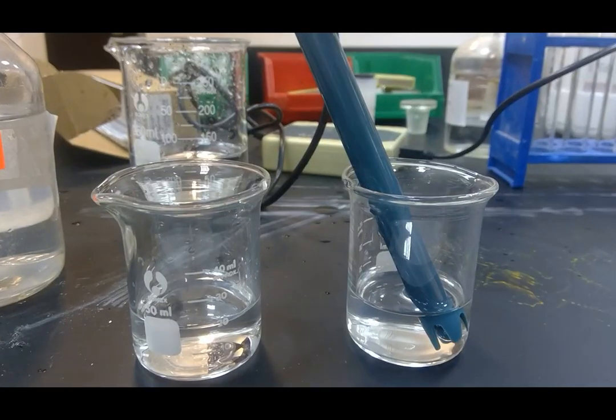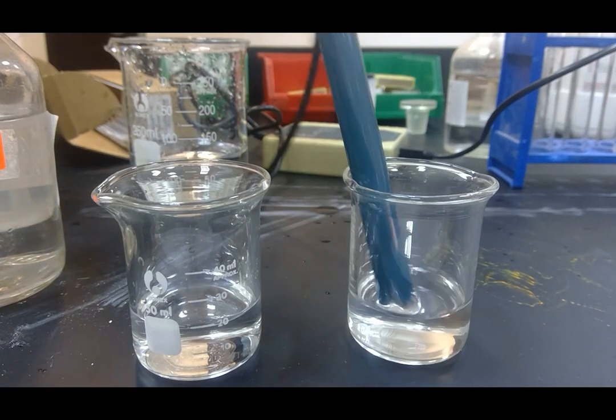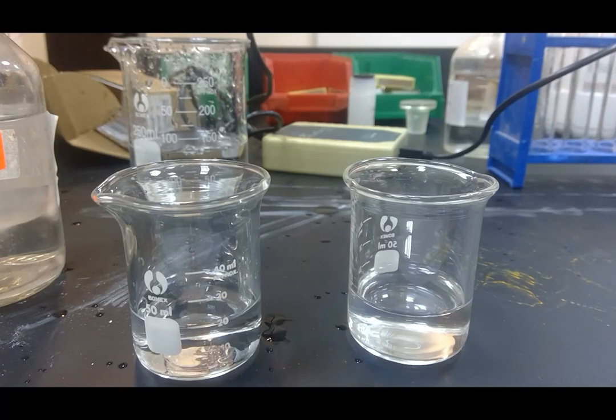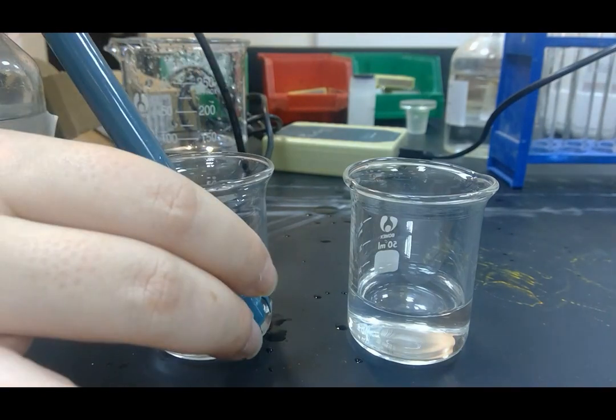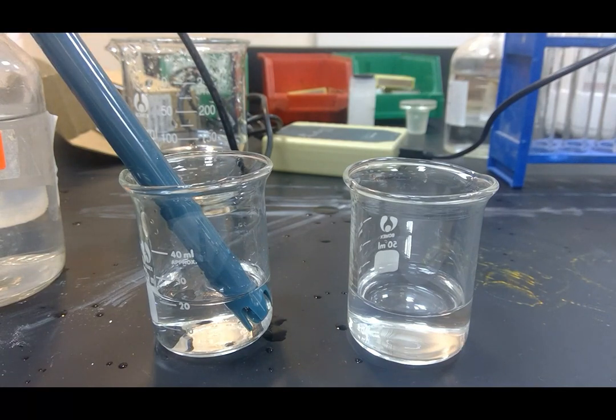Okay, now I am going to rinse my pH meter again, just to remove any extra hydrochloric acid which is on there. And then I'm going to do the same thing and put it into my ethanoic acid. Wait for a second, and then I'm going to look at the pH of that solution.